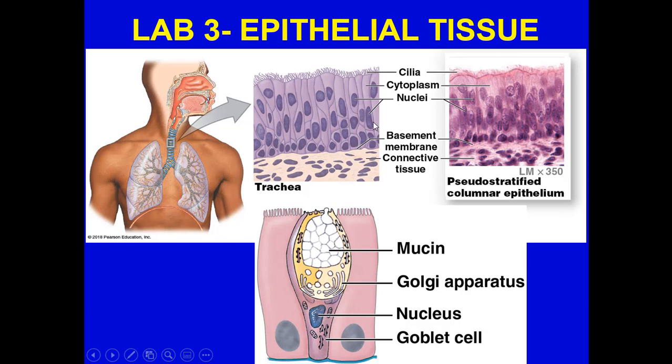You will also see how the cytoplasm and the nuclei aren't always nice and even in their distribution. But finally, one of the other things that'll really help is the fact that you're going to have cilia here. Not microvilli. Microvilli are for absorbing, increasing the absorptive surface area.